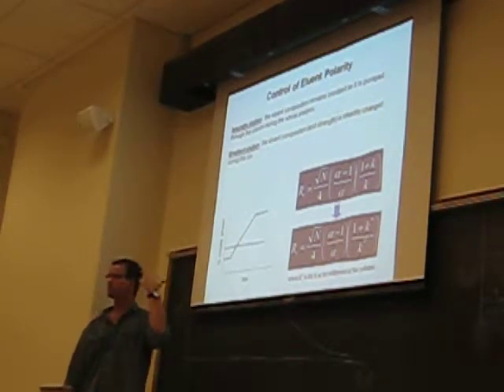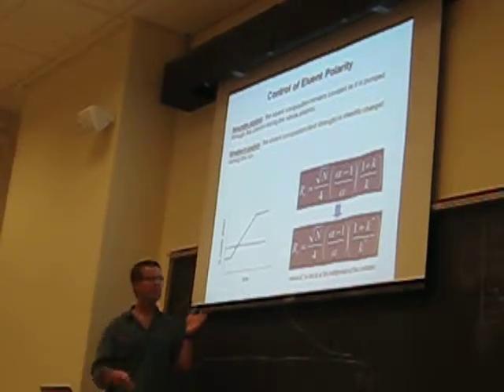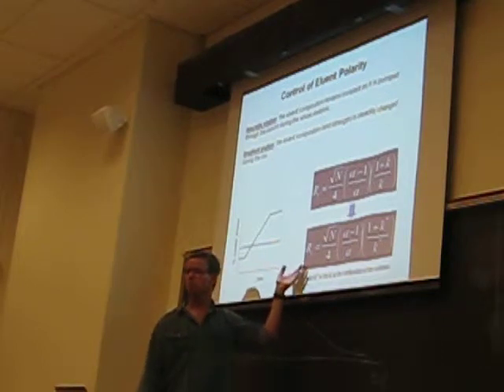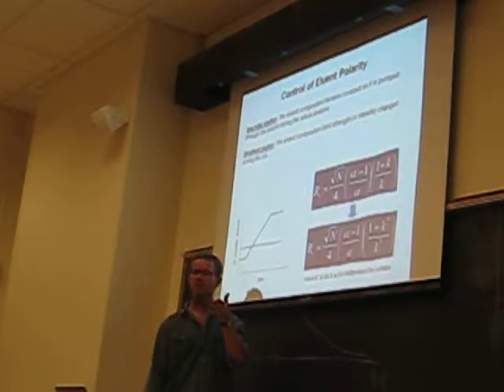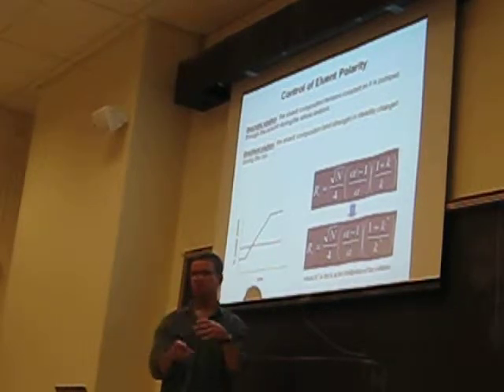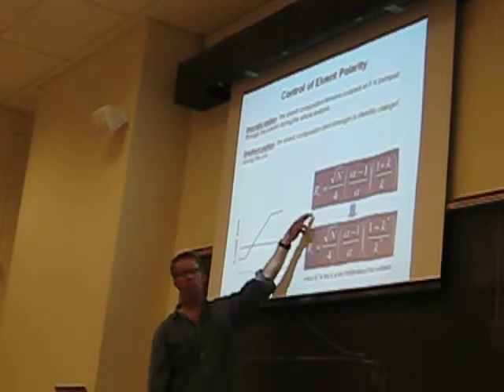And this is what manufacturers would do, or what people would do in reporting. They're developing a chromatographic method. In reporting in their papers, they would actually calculate for that method what the resolution was. And this would allow people to compare, if they're trying to separate the same analytes using different methods, the performance of different methods for separating those analytes from one method to another. Rather than just say this chromatogram looks like this compared to that, they can actually quantify what the resolution was of that method.